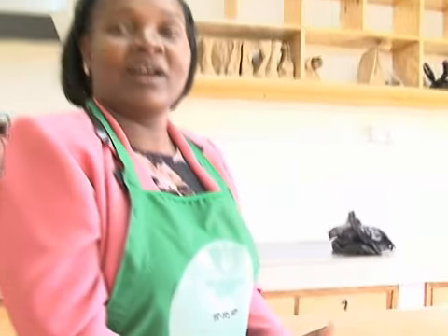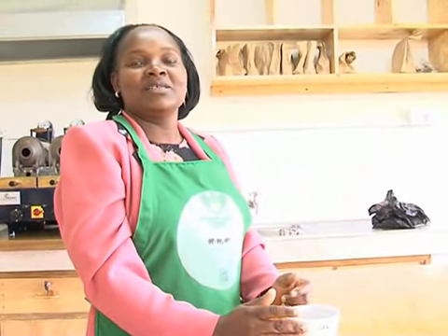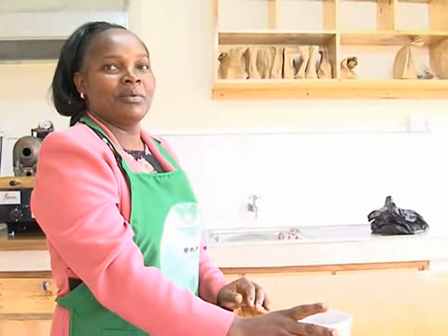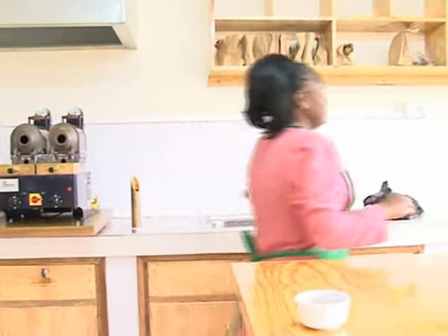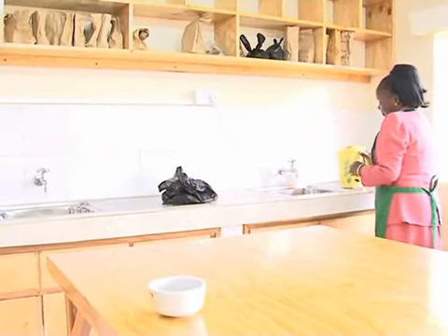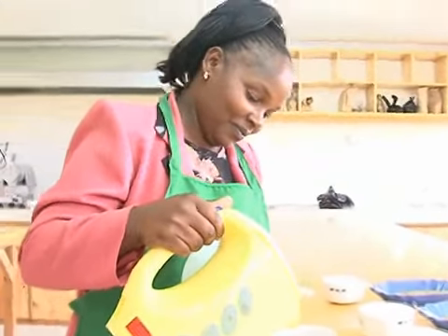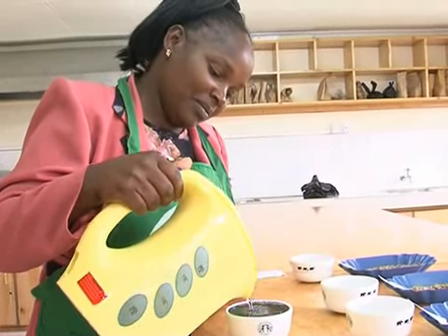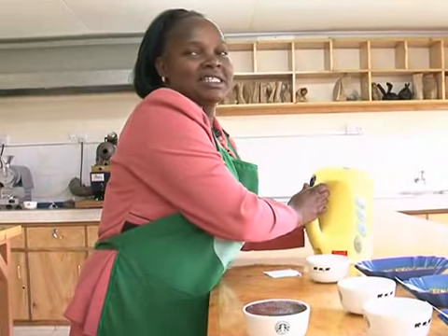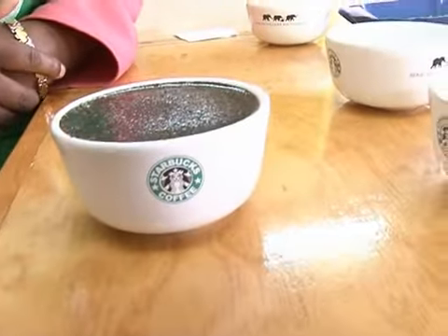Then from there, when it comes to cupping, you first smell the coffee in that cup. Then you'll be able to tell the smell of that coffee. Then you prepare the cup, whereby you put hot water on these 11 grams of coffee in this cup. You put boiling water, you fill the cup to the brim, and then you wait for 4 minutes for that coffee to be ready. So you are waiting for 4 minutes.